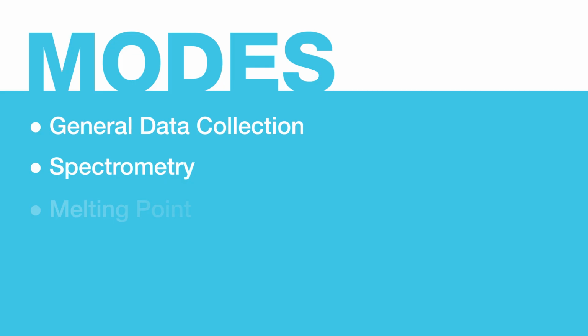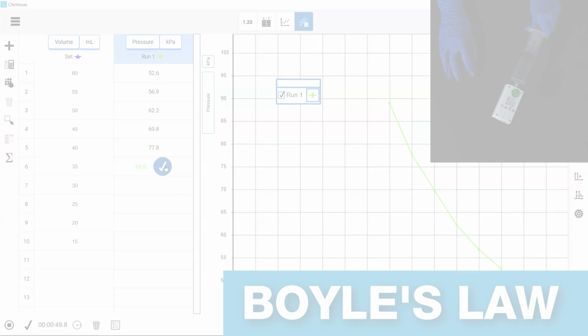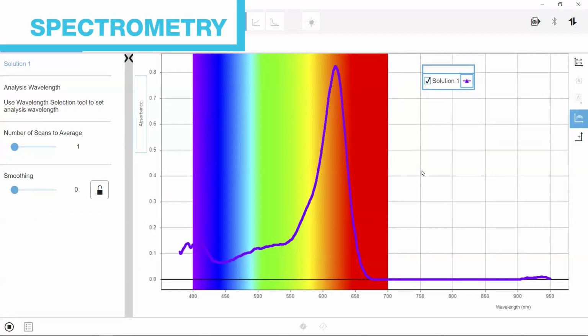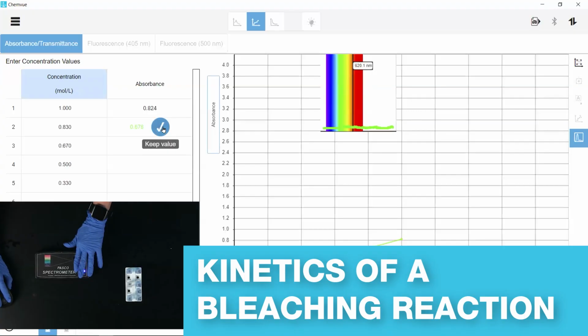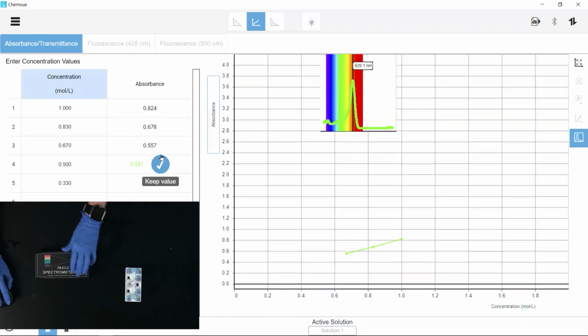Chemvue is the cleanest data analysis software fine-tuned for advanced chemistry labs. With our smartest displays yet, these modes streamline experiments and set students up for success. We took great care and consideration when designing this app. Complex chemistry shouldn't mean complex usability.